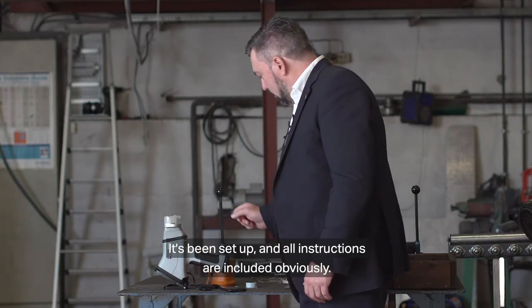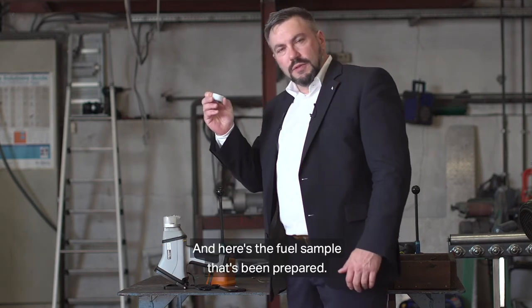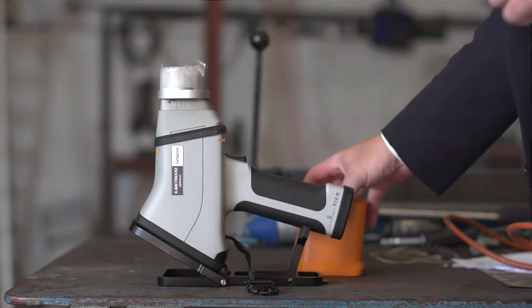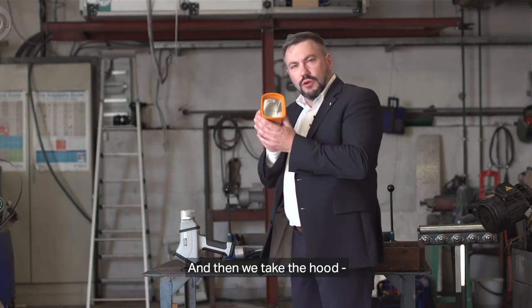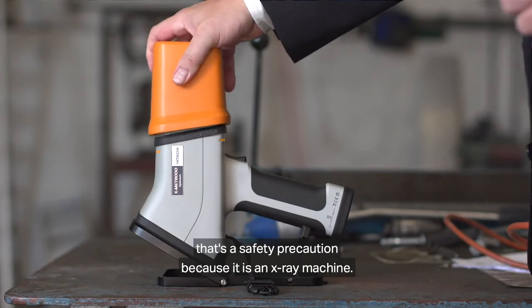It's been set up and all instructions are included, obviously. Here's the fuel sample that's been prepared. So we just put that in like that. Then we take the hood — and that's a safety precaution because it is an X-ray machine.